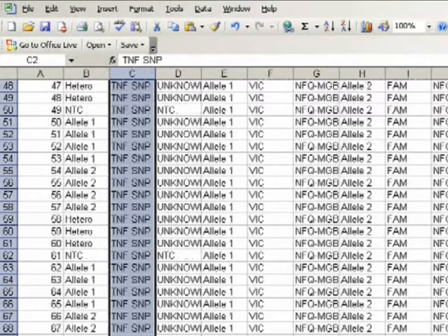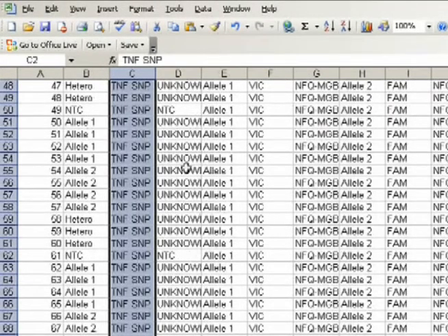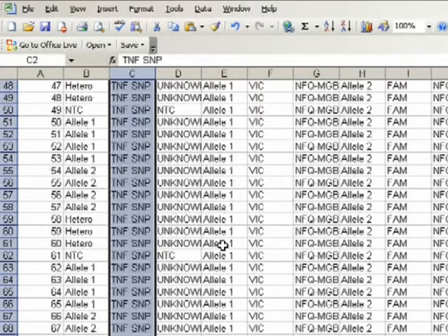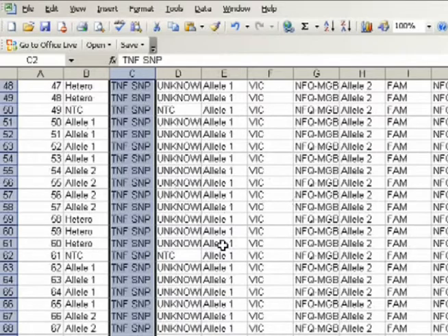For time's sake, let's pretend I've entered all information for samples, tasks, assay names, etc. for my new run. I'm now ready to import this worksheet into a new VS7 run file.